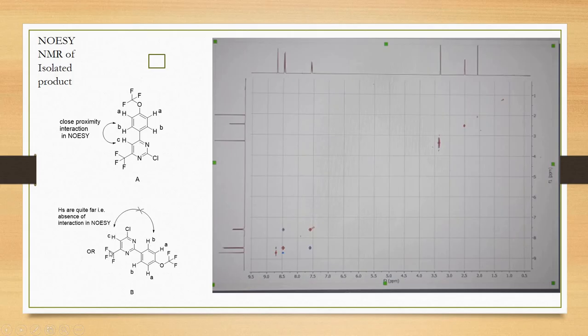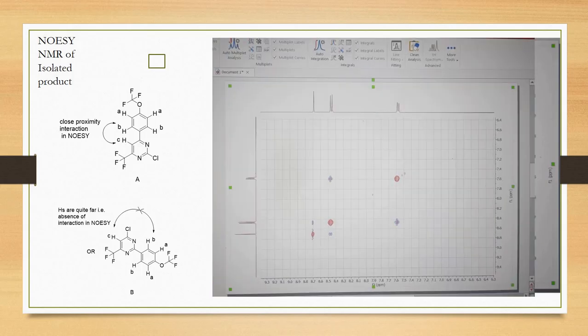Now let's see. This is the NOESY NMR, and you can see that this singlet proton is interacting with this multiplet. I will show you the zoom part of this. Now you can see very easily this proton is interacting with this singlet.